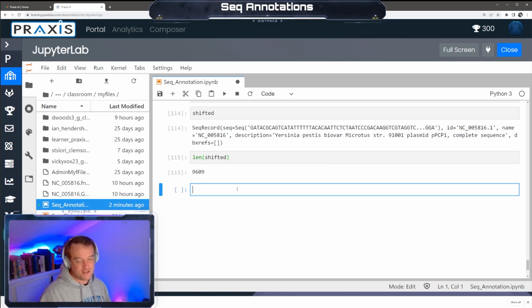If you and another person both sequence the same circular chromosome or the same plasmid, your records might look different based on where the sequencing started, or where it was put together to start. So you can shift that.